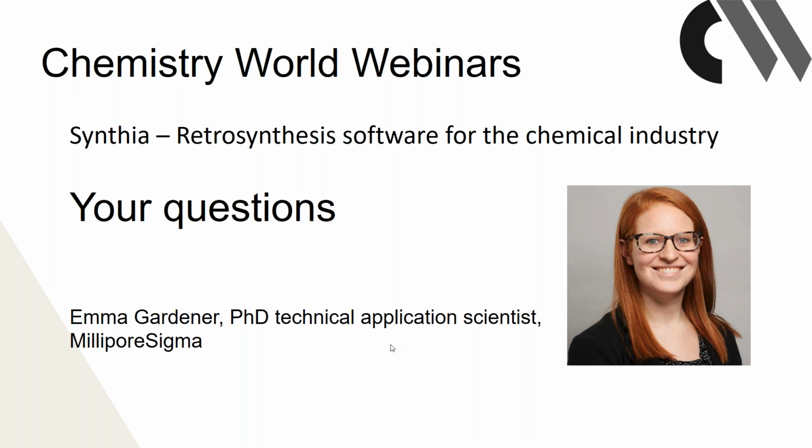We really are the only retrosynthesis tool that has a hand-coded rules database. And I talked in the presentation about the advantages of that, of really being able to look at the full molecular context of the reaction as it's planning it, and allows us a more comprehensive coverage of the reaction space. So that's something that's really unique about Synthia.